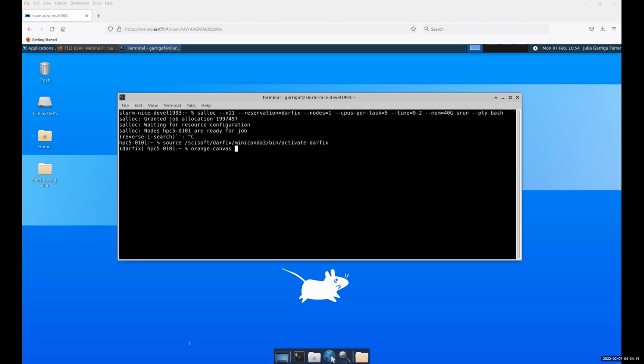I don't see the Slurm in this remote ESRF. Was it allocated only for the attendants of the meeting? Because I'm here for the Peter Schittner, but I'm connected to ES remote through my own account. In order to be given access to the Slurm partition and so on, I think it's only enabled for the people that were inscribed into the group.